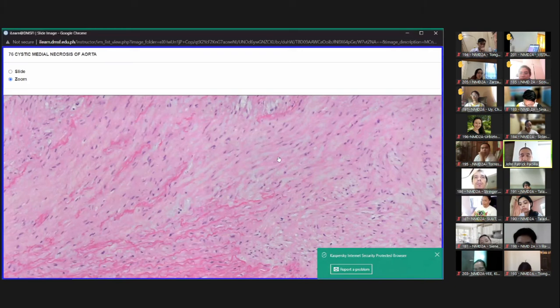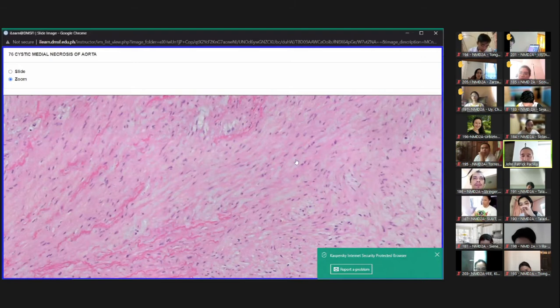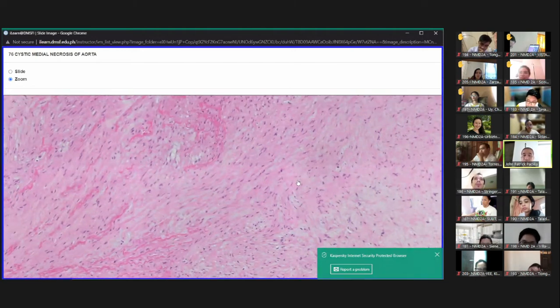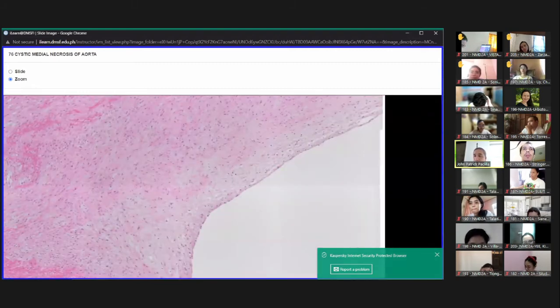They can be hyaluronan, or connective tissues that would be deposited, interspersed between those smooth muscle fibers. Connective tissue diseases can be the reasons for the deposition, and this can be one of the causes again of aortic dissection. So next slide, we have aortic dissection.